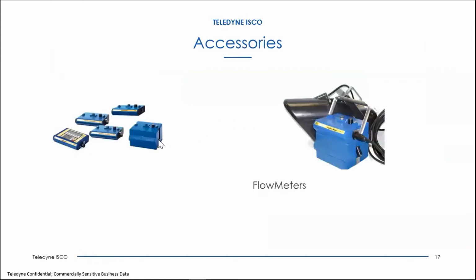Other accessories are flow meters. There are different types of flow meters out there. Pretty much all of them are capable of interfacing with pretty much any sampler. Lots of different flow meters out there. These are our area velocity type flow meters, and laser flow meters here. Lots of different flow meters will interface with samplers.